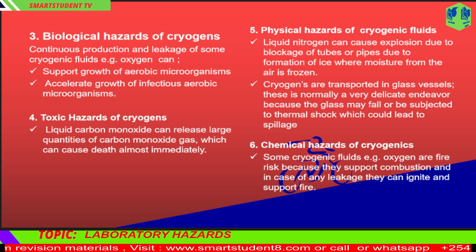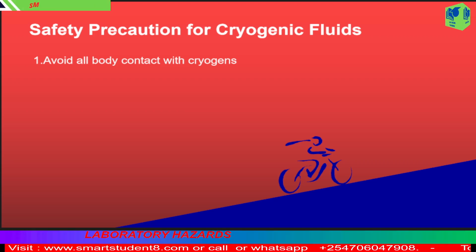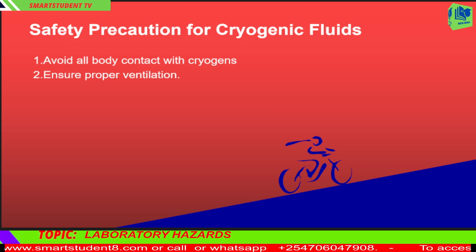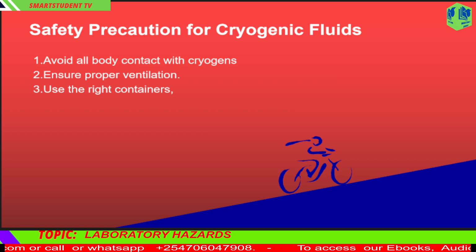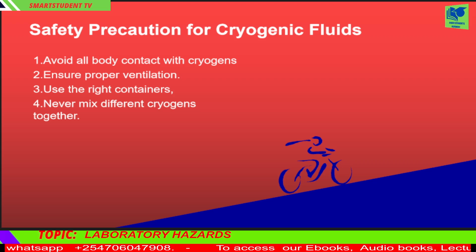To safely use cryogens: 1. Avoid all body contact with cryogens by wearing protective clothing. 2. Ensure proper ventilation to discourage pressure build-up. 3. Use the right containers, which can sustain and withstand the rapid changes in temperature. 4. Never mix different cryogens together.